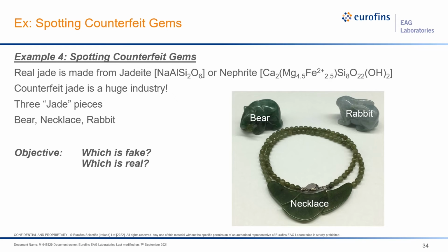Now, counterfeit jade can be produced in a number of ways, but the most common is by using either cheaper minerals or enhancing the gem through a staining or resin impregnation process. The resin or epoxy fills in any pits there may be and hides imperfections. Untreated jade, however, is very rare and expensive.